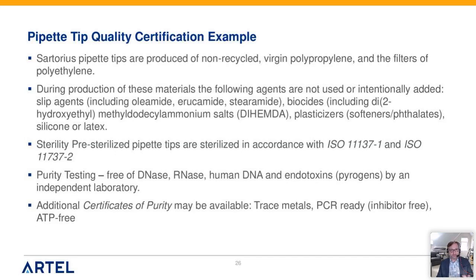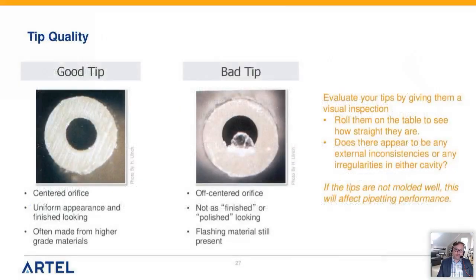So this talks about the components. What we're going to talk about in the next couple slides here is really about the performance of the tips. And what I'd like to show here is we can very clearly see good tip and bad tip. And really this is about all of this flashing material.